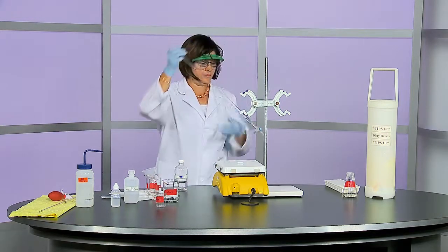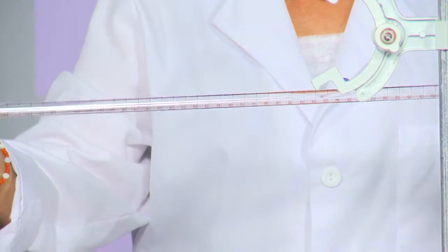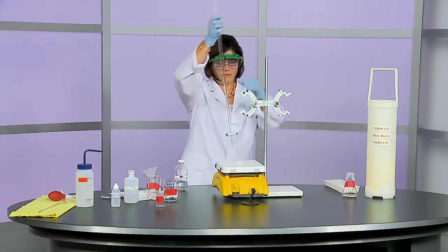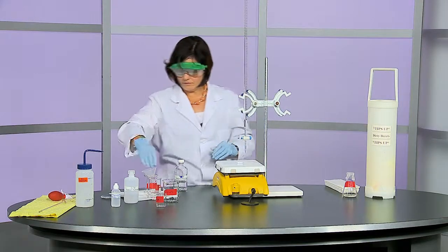Turn the burette on its side and rotate it as you change its angle to rinse the inside walls of the burette with the solution. Place it back in the burette clamp. And empty the solution through the tip into the waste beaker.